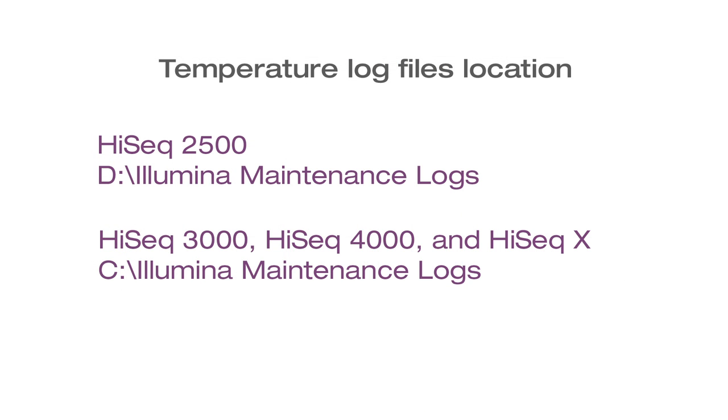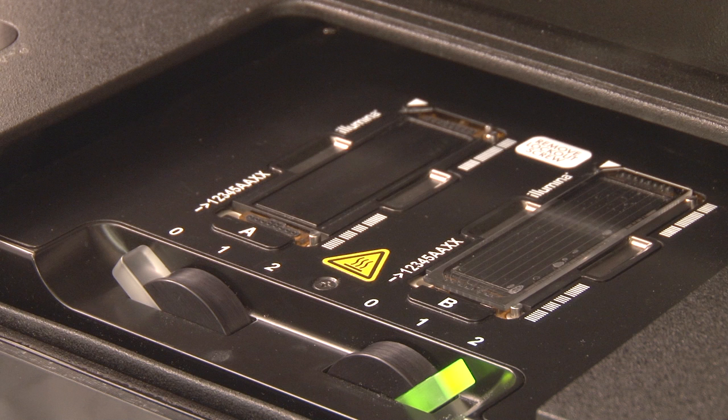The temperature log file can be found here. Now let's take a look at the flow cell stage. This metal surface is heated and cooled during the sequencing run, as required by the SBS chemistry.